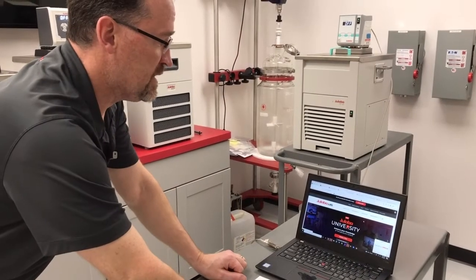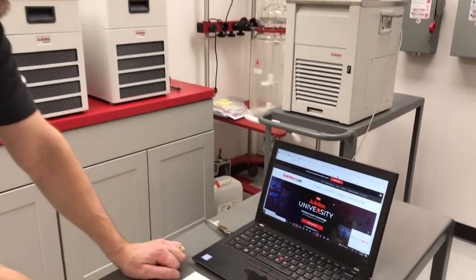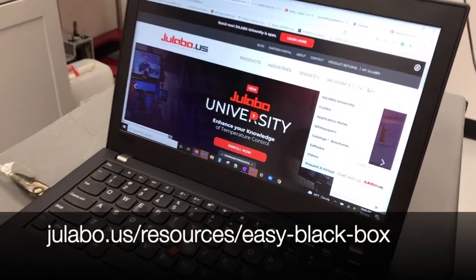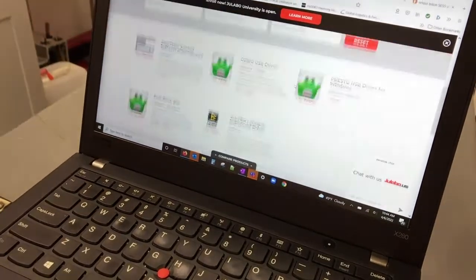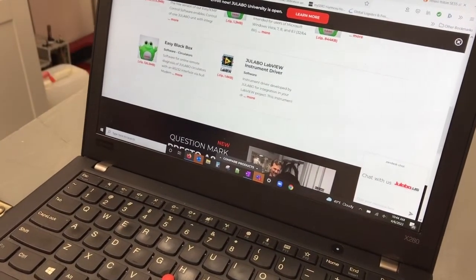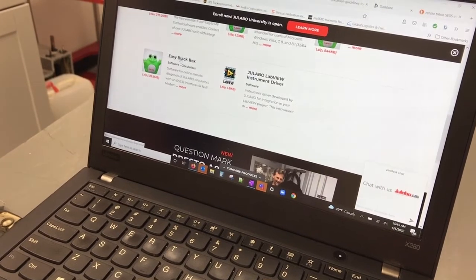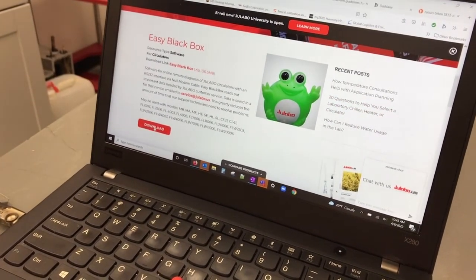If you want to download Easy Black Box for our older chiller line, go to www.julabo.us, go under Resources, then go under Software. Under Software, proceed to download Easy Black Box, then click the download button.